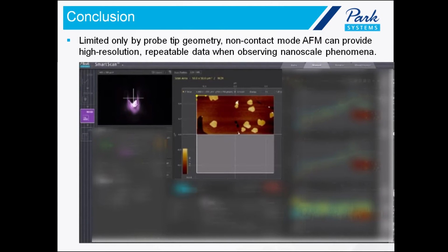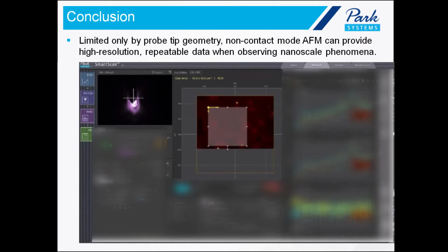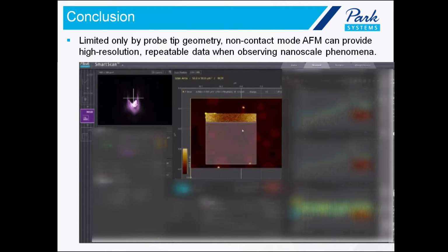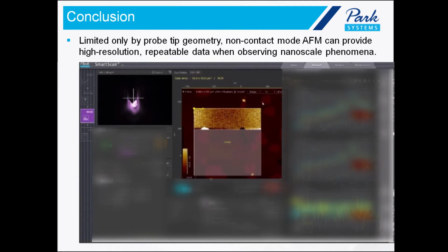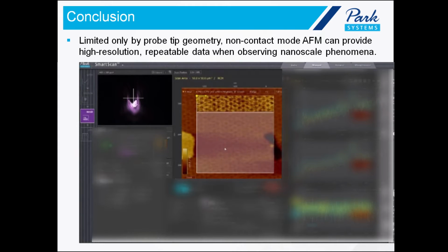So what's happening on the screen here, and I think I failed to mention this while the animation was originally playing, is that this is actually a look at the software that's being used to self-optimize automatically the scan parameters and the different settings rather, that go into the scan of the HBN graphene sample. By higher acquisition time, this is a follow-up question to the question answer. Do you mean like setting a lower scan rate? Is that what you're asking?